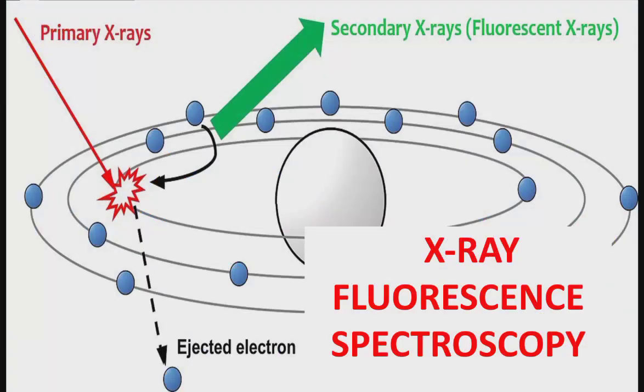So today in this lecture we're going to study X-ray fluorescence spectroscopy. We have already discussed different types of spectroscopy like UV visible spectroscopy. We have discussed infrared spectroscopy. So today we are going to study our next analytical technique, that is X-ray fluorescence spectroscopy.